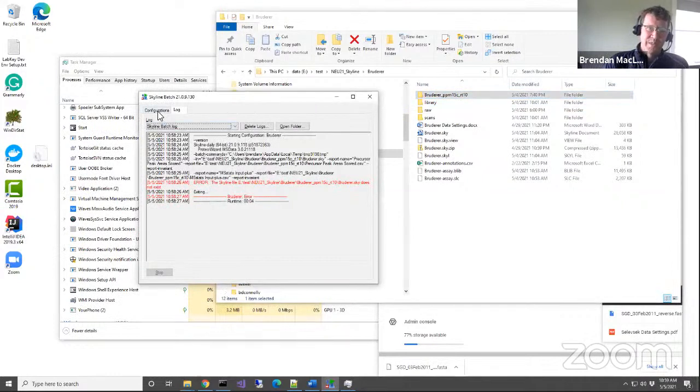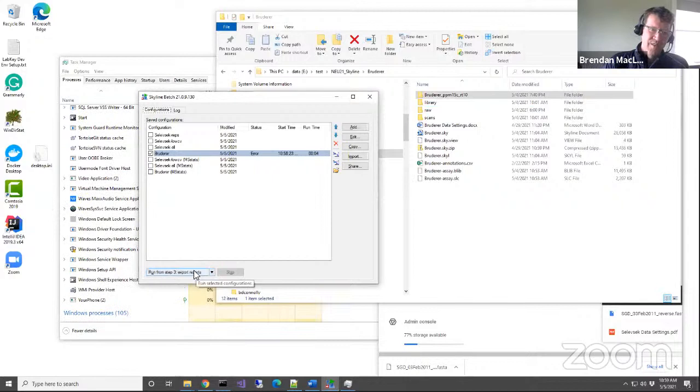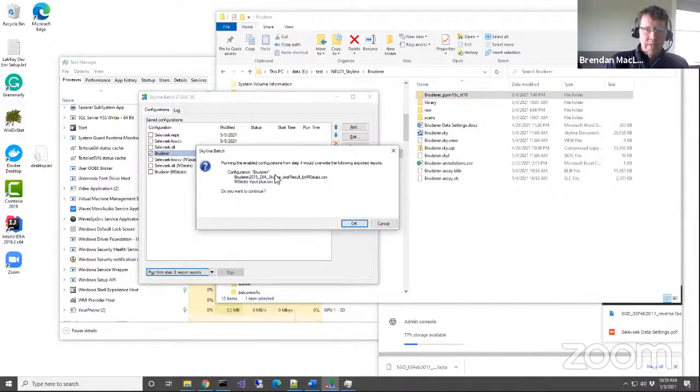then now I should be able to go back and run from export reports, and it says MS stats. Do I want it? So now this is telling me, hey, this is going to overwrite your MS stats. What is this going to do? It says running.